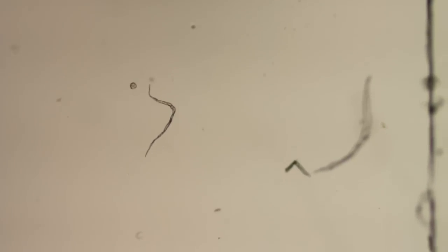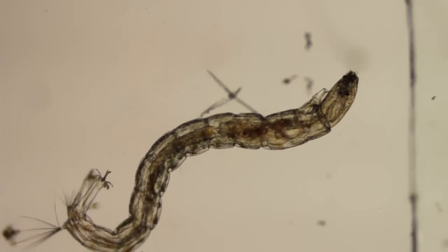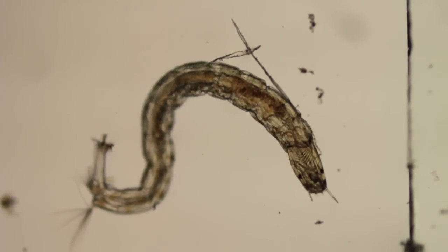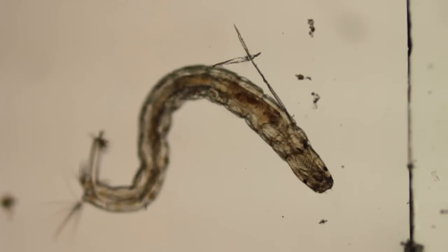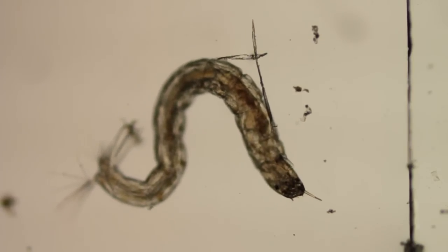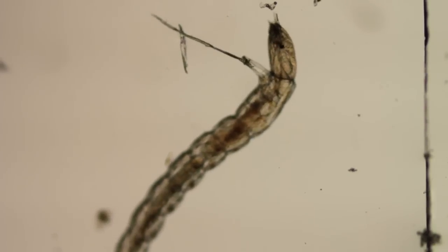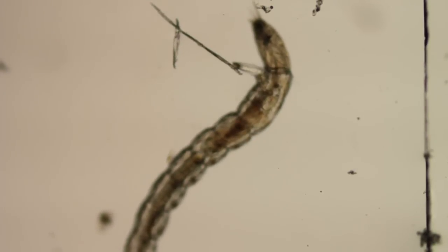I got a few spines and put him in a centrifuge tube and spun it down for five or six minutes. Then I used a pipette to get the water at the bottom of the tube, and this guy was in there when I put him on the slide and put the cover slip on.